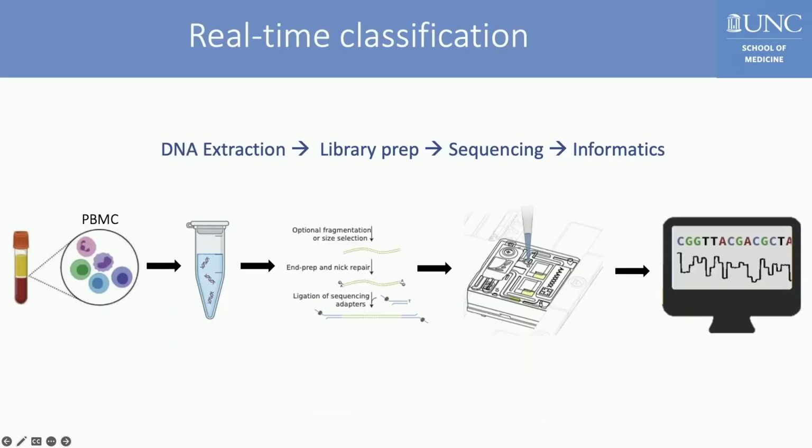So this was really exciting to us, and we wanted to move forward and see how this worked in real time. So for those roughly 30 samples, those are what we call retrospective samples. We know the karyotype, we know the fusions. These are ones where we haven't yet determined the classification. So these are active patients, and the clinical pipeline is still ongoing and was not yet complete by the time we sequenced these samples.